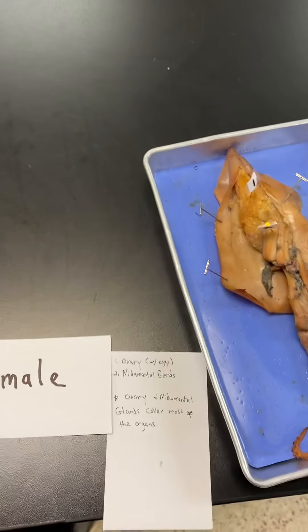I only have those two structures labeled on the female because it's the same as the male otherwise, and this one hides a lot of structures. Here's a review recap — this one is actually a lot better model than the one I did in the other video. Here's the male squid and female squid anatomy — make sure you study for the lab practical, and let me know if you have any questions.